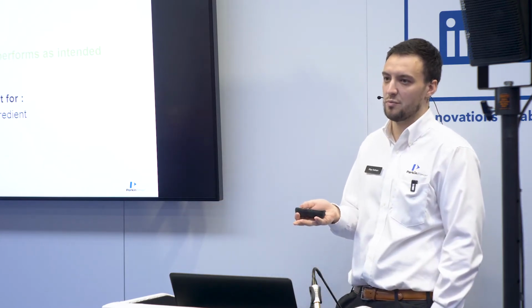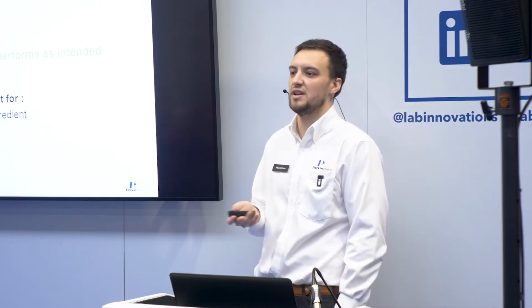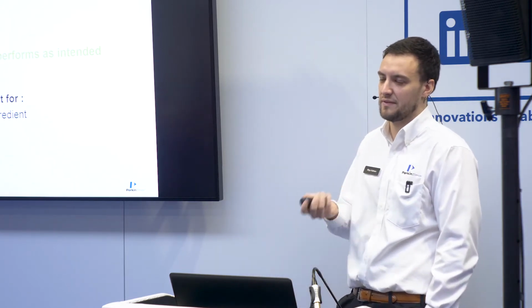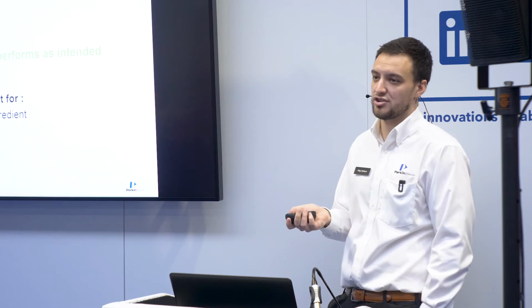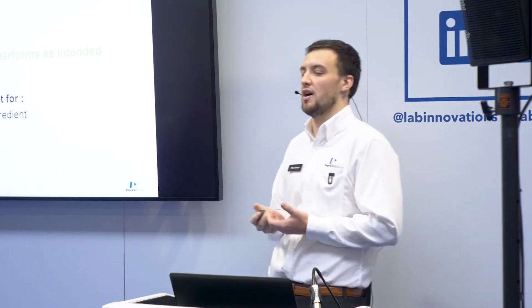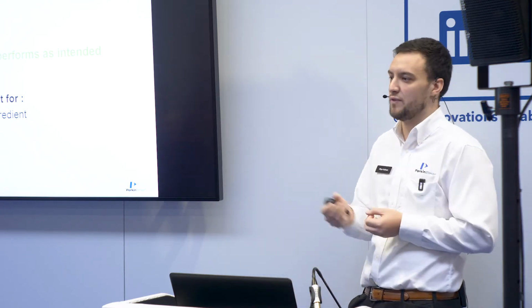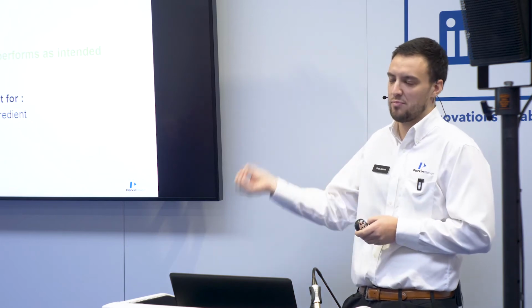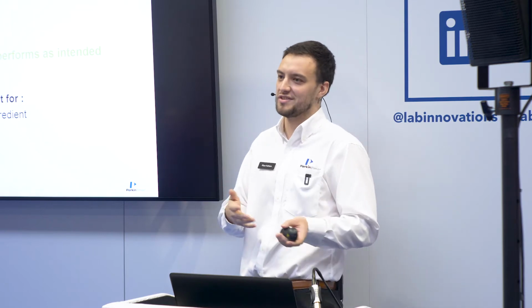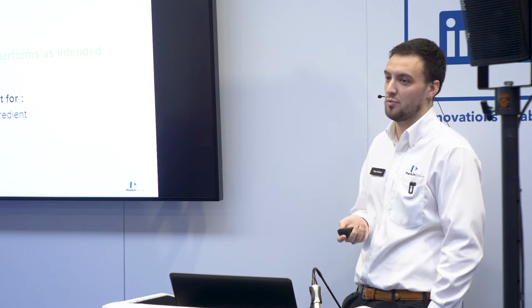This is for a number of reasons. Firstly, if you don't have equal distribution from your tablet, it might mean that you have issues in your manufacturing process in terms of the mixing of the different ingredients. The other issue might be that it's a common practice today to break tablets in half to split dosage or whatever the pharmacist recommends. So if you have a tablet that has all the API on one half and not the other, when you take the tablet, you actually get an overdose on the one side and not on the other. So uniformity is a big issue that we need to make sure we're addressing.